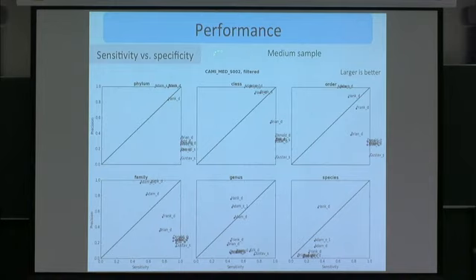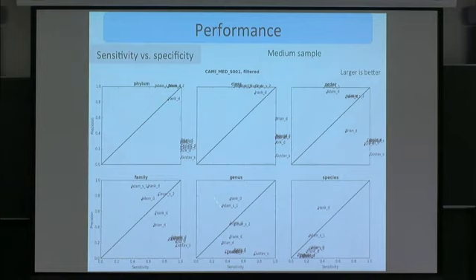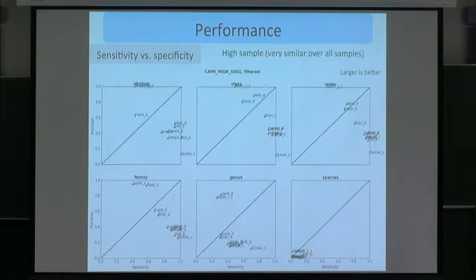Now, this right here is the second sample of the medium. So you can see that if we flip back and forth, they don't change a whole lot. They kind of wiggle around a bit. But again, you see Hank, Caesar, Adam, and Gustav all the way down. So same patterns between the two of them. When you go to the high, those same patterns remain at the order, family, and genus level. All of a sudden, you then see this little Frank pop up over here. But then again, at the high sample, down at the species level, precision and sensitivity, every single method is doing uniformly poorly.